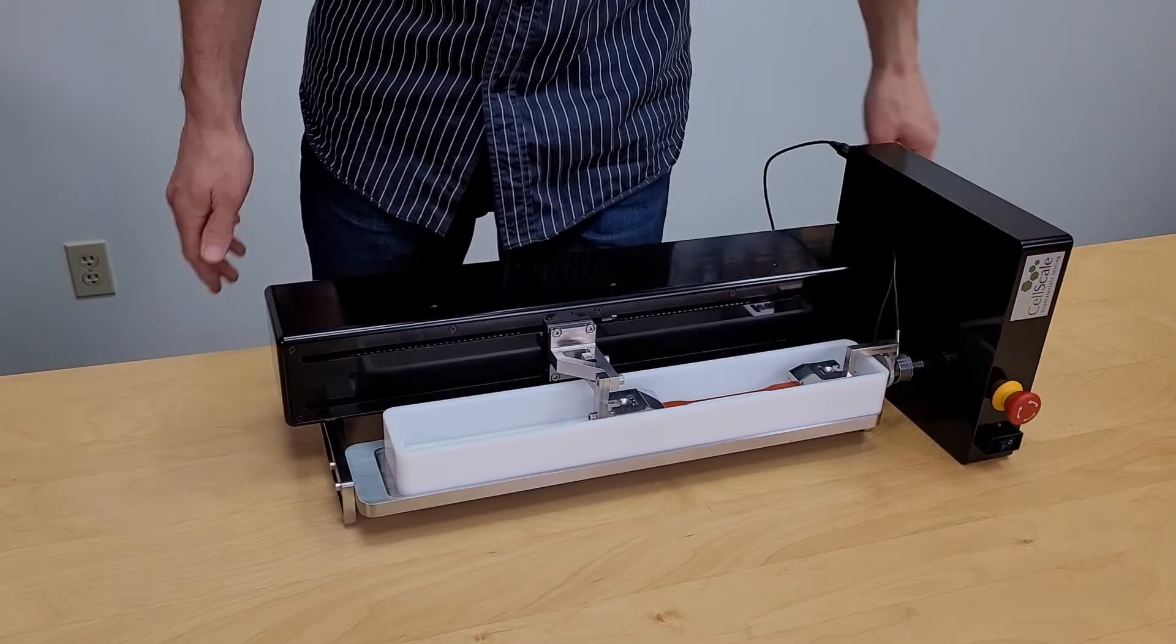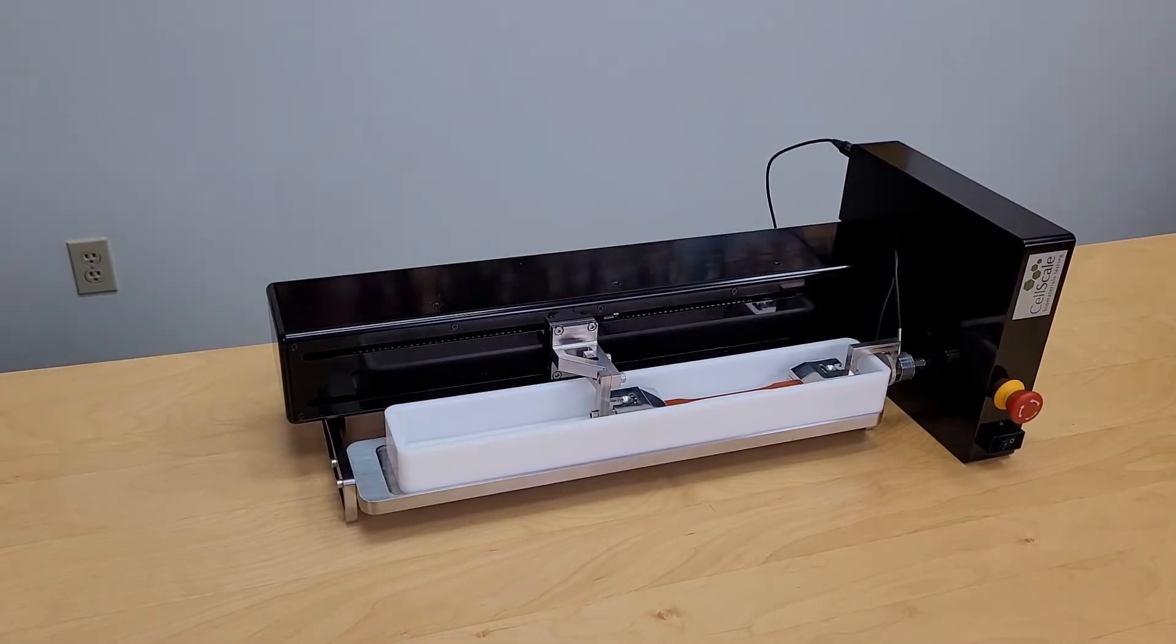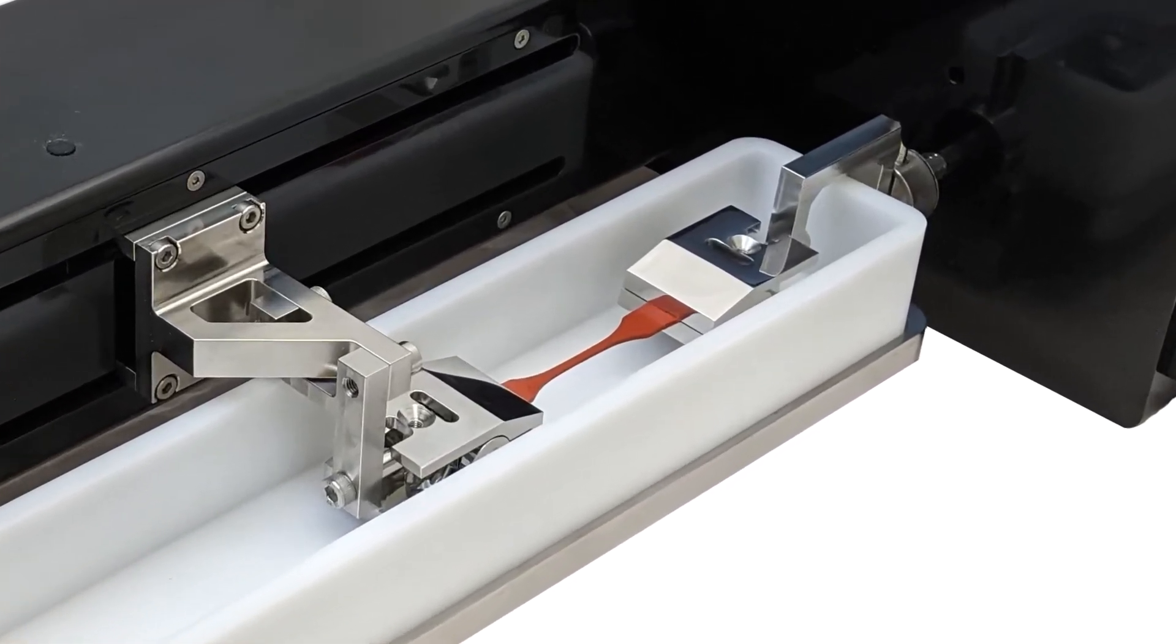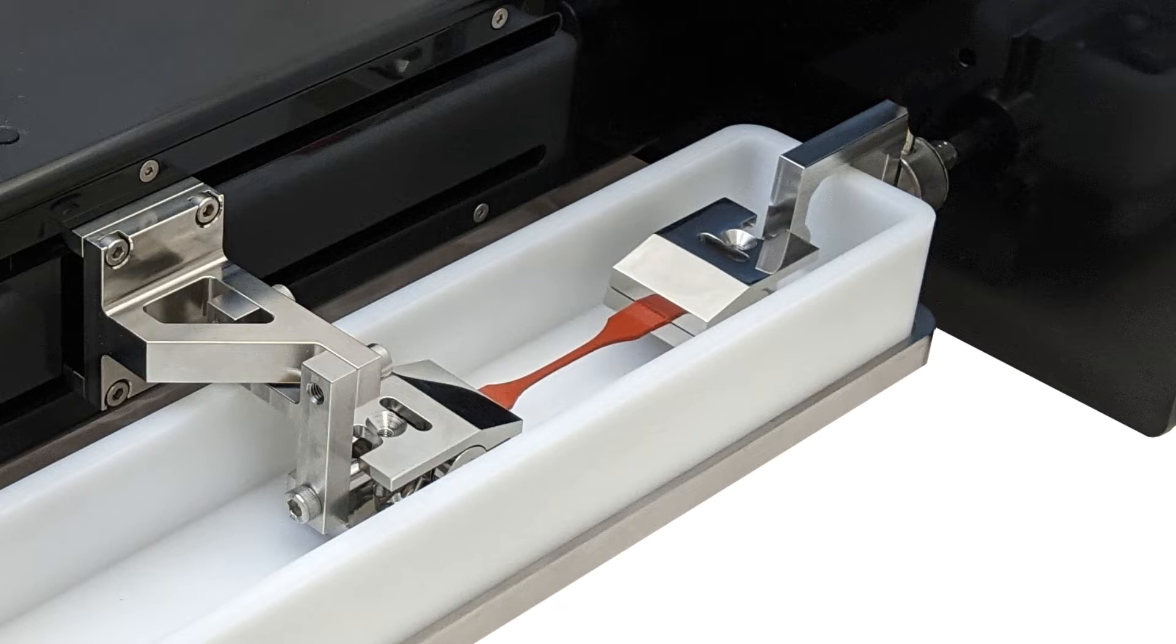In the horizontal configuration, the load cell is mounted to the fixed frame rather than the moving crosshead. This can also be done in the vertical orientation to minimize the effect of inertia and vibration when using very small capacity load cells.